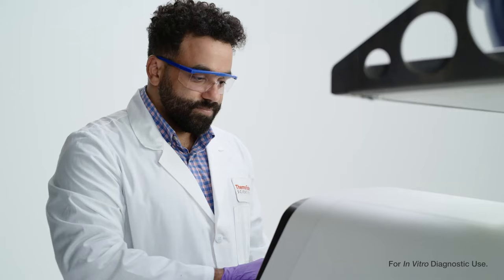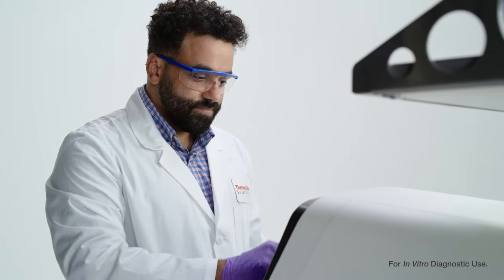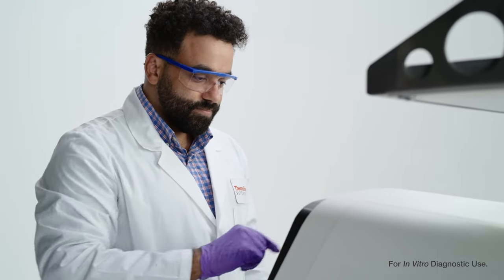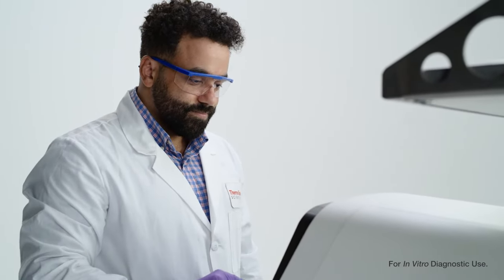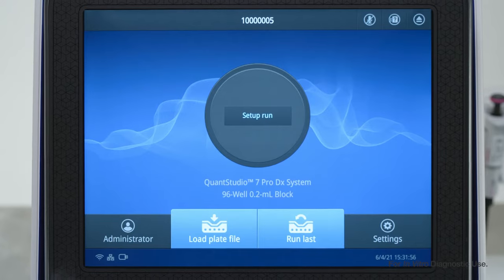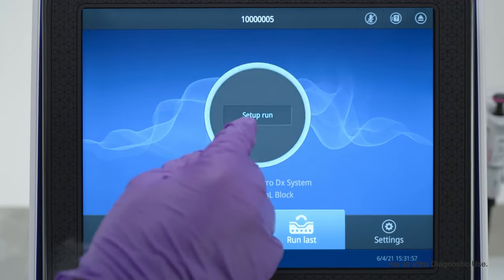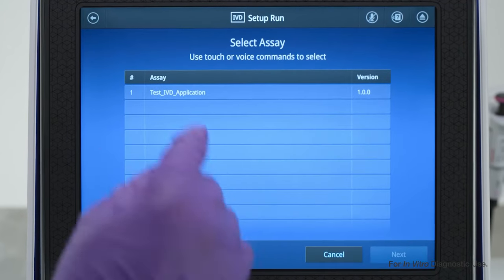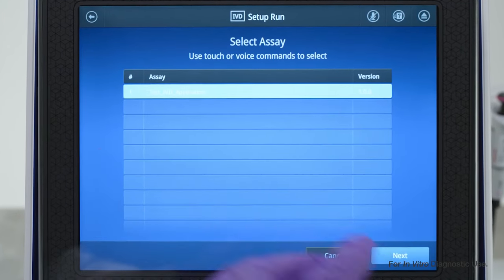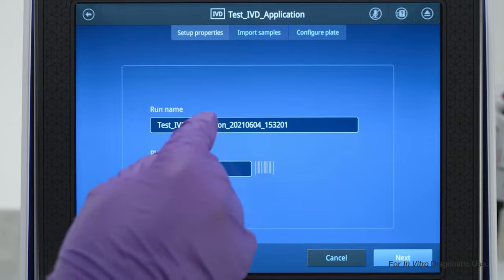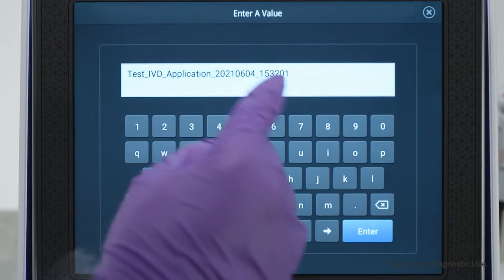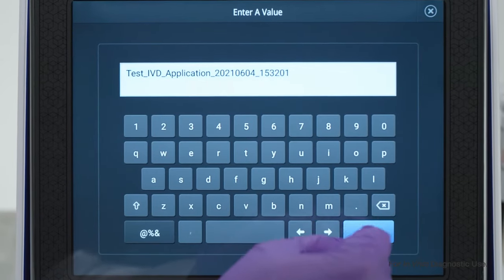First, sign in to your SAE Administrator Console DX account, then select your ADF and modify the necessary information such as sample name, run name, plate layout, etc.